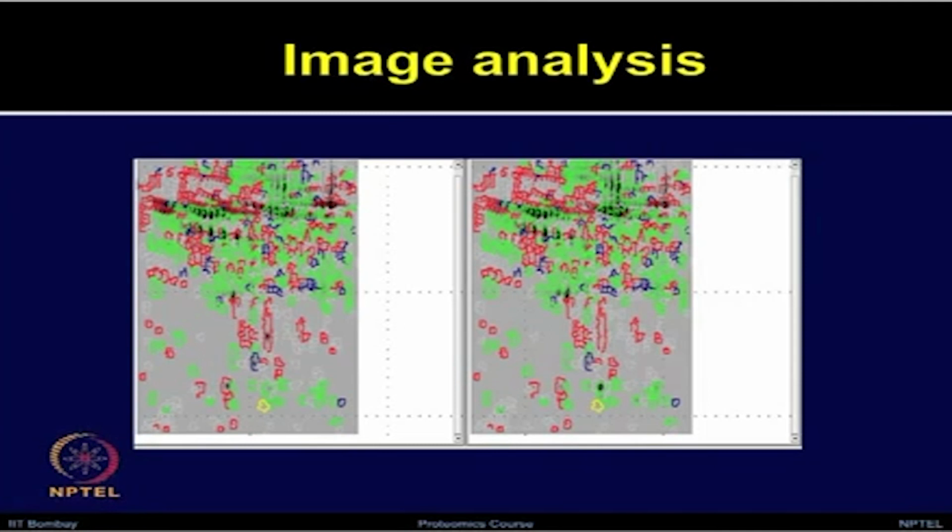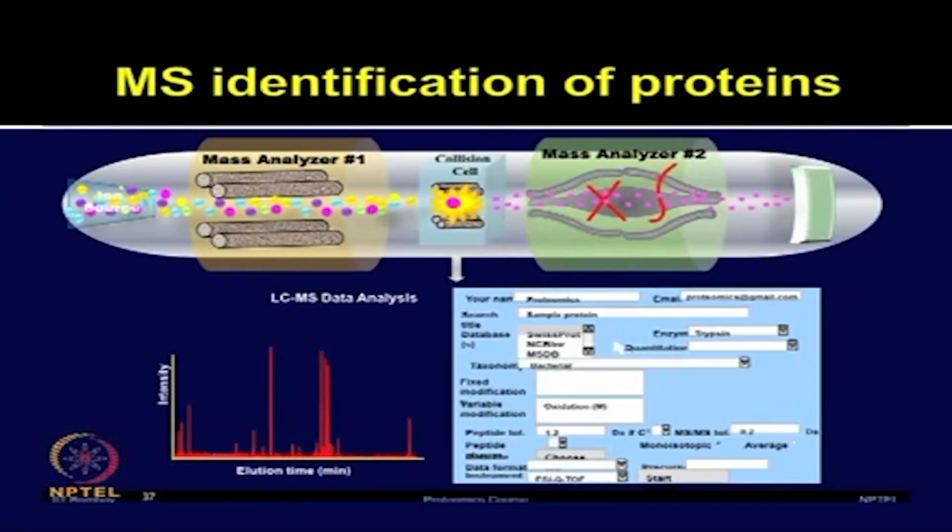Still, you have to go through individual spots, look at how real and significant those changes are, and look at the 3D views of those spots to ensure they are reproducible among the various control and treatment groups. The different levels of analysis were performed, which we talked about earlier, but this just shows you the final output, that 63 spots after all the analysis steps were considered significant.